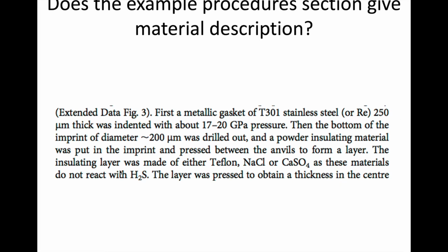They also talk about an insulating layer, and they say that it can be made of a range of things. So it doesn't necessarily have to be one material. It could be a range of materials as well. So that's another thing: the materials you used. Obviously we're talking about cartridge brass. That better be there, but give me more description of what you're using, right? You want to be a little bit more specific, and you want to be as specific as possible.